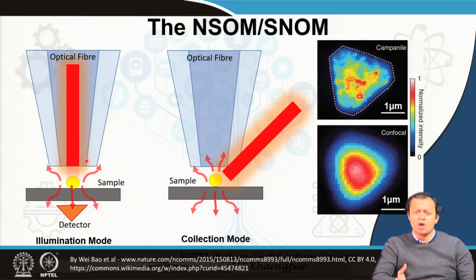Obviously, there is a huge amount to unpack here. I would have to take an entire course on NSOM itself. People make their career out of NSOM, not just their PhD degree or their master's thesis. I cannot explain half of it. Atomic force microscopy tip, a cantilever comes, you collect it differently, different things are happening. I know, trust me, those of you who are chuckling that the most important part has been left out, this is the most important part, not the atomic force microscopy. This is the most important thing: how we are breaking the diffraction limit.